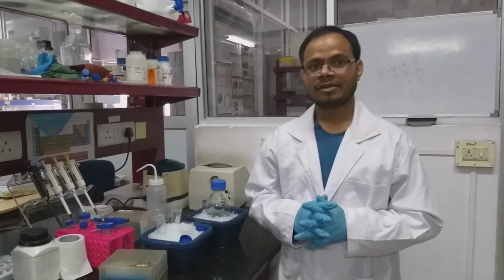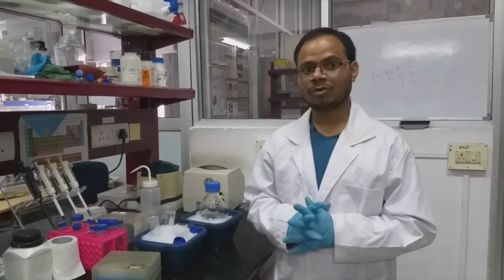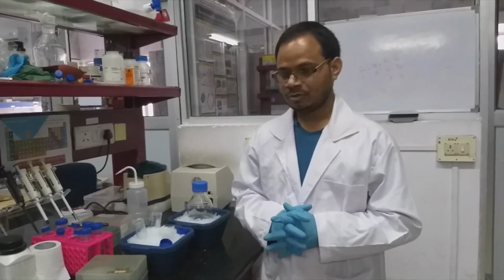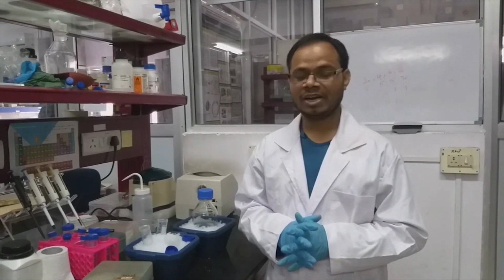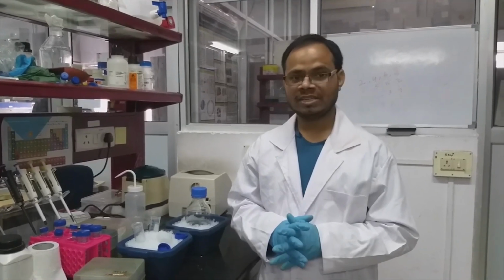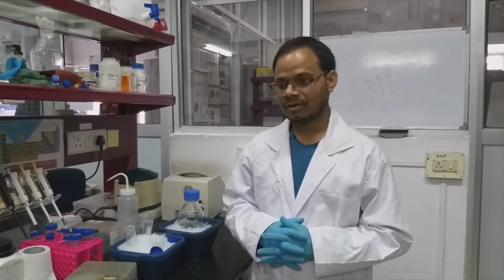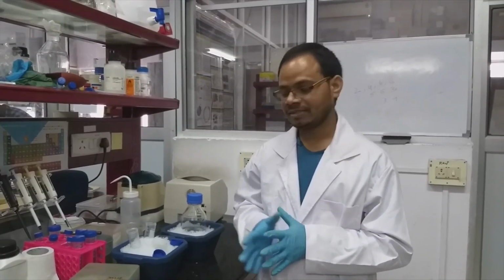Hi everyone, myself Swayam Prabha, a research scholar at the Department of Biosciences and Bioengineering, IIT Guwahati. In this video, we will demonstrate how to sonicate the bacterial pellet, how to lyse the bacterial cells. We can lyse bacterial cells in multiple ways, sonication being one method. Apart from that, we can use a homogenizer. In this video, we will show you how to use a sonicator and lyse the cells.